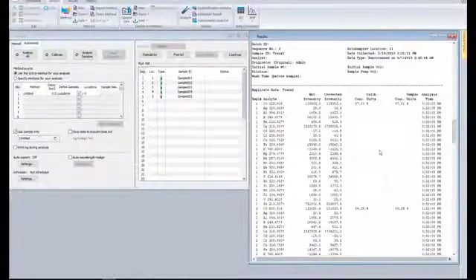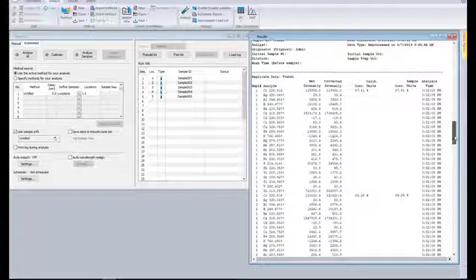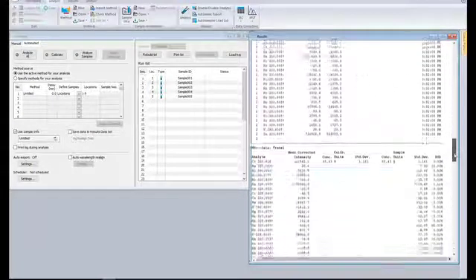When running particle count analysis, the results for each sample will be shown just after the ICP results in the results window.